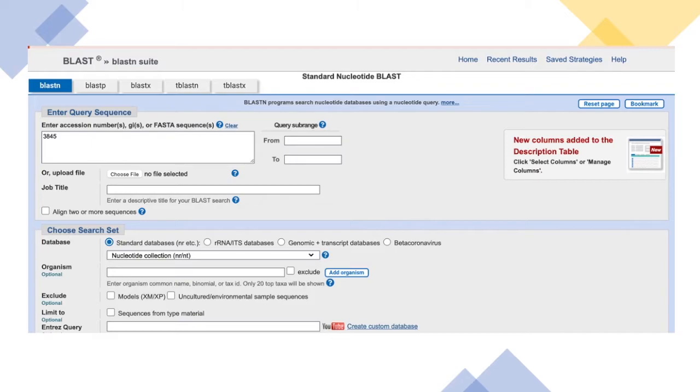As a researcher, this is a really useful tool, being able to go to the website and run BLAST. But sometimes it gets frustrating when you're dealing with a lot of DNA sequences that you need to check one at a time, or you don't have access to an internet connection, or all sorts of other problems that could go wrong with using this website.